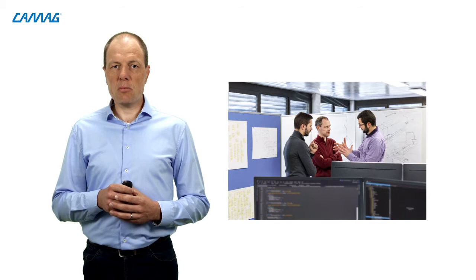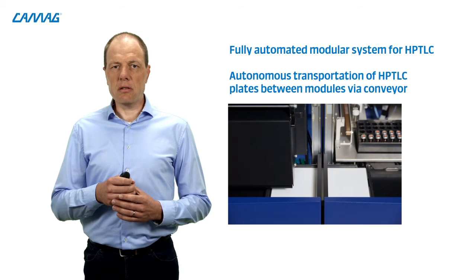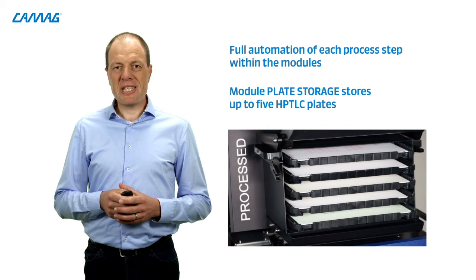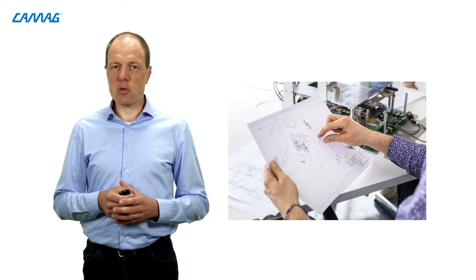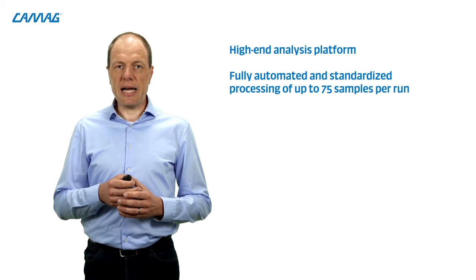The HPTLC plates are transported autonomously on a conveyor between the modules. Each process step is automated within the modules and up to five plates can be stored in the module plate storage. We designed each module from scratch, putting together our 60 years of experience in HPTLC with the latest technological possibilities. Like this, we achieved to design and produce a high-end analysis platform for the fully automated and standardized process of up to 75 samples per run at the highest level of accuracy and precision. Welcome to the next dimension of HPTLC.